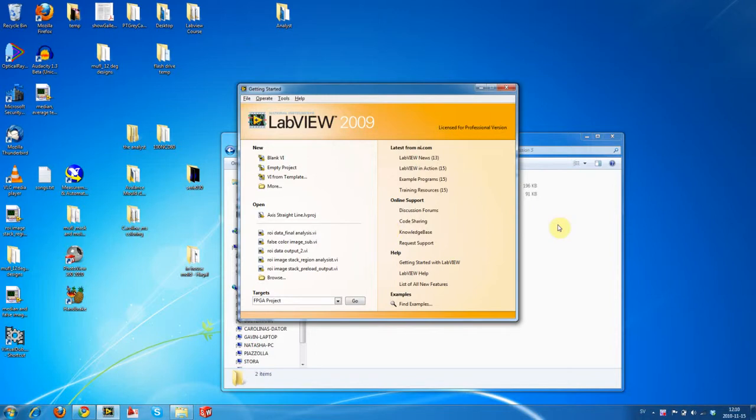Okay, so welcome to session 5, the final session in this short course. This is going to be a little bit intense. This is going to need watching a few times from the course, and hopefully we're able to finish it within the 2 sessions.